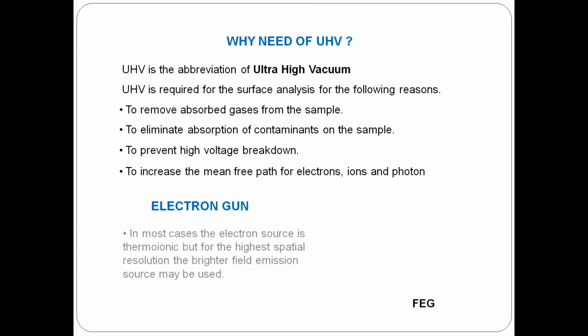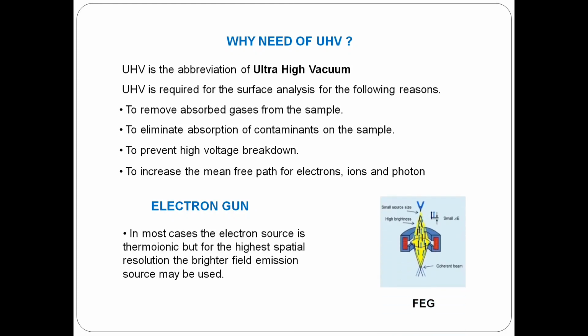Electron gun. In most cases, the electron source is thermionic in nature. But for the highest spatial resolution, a bright field emission gun source may be used, which we discuss in the upcoming slide. Here is the image of the field emission gun, which is used for better resolution.